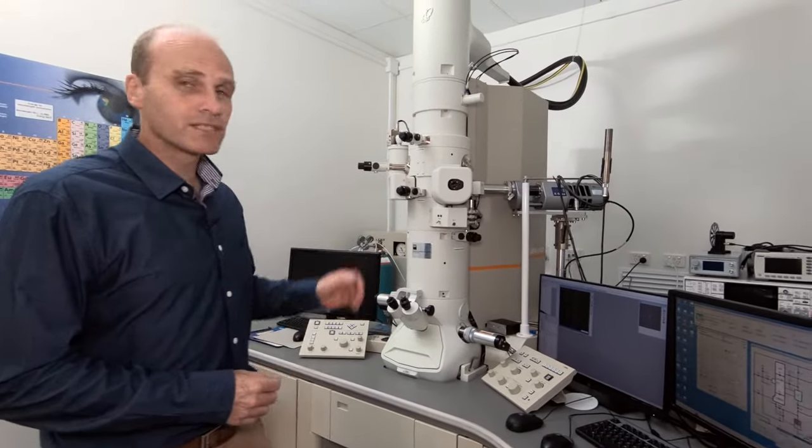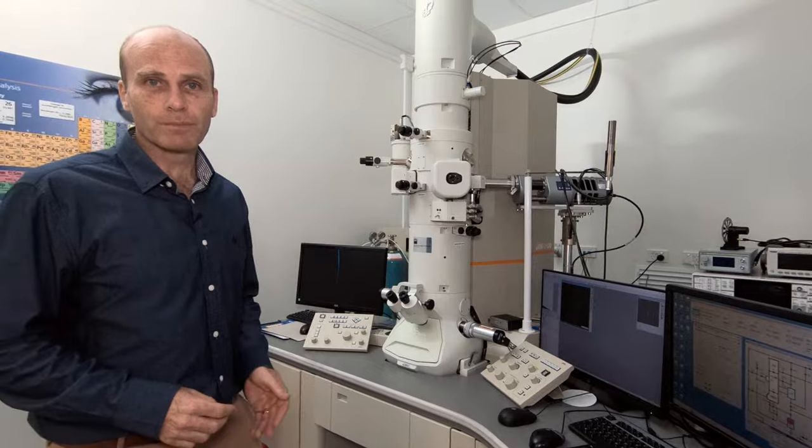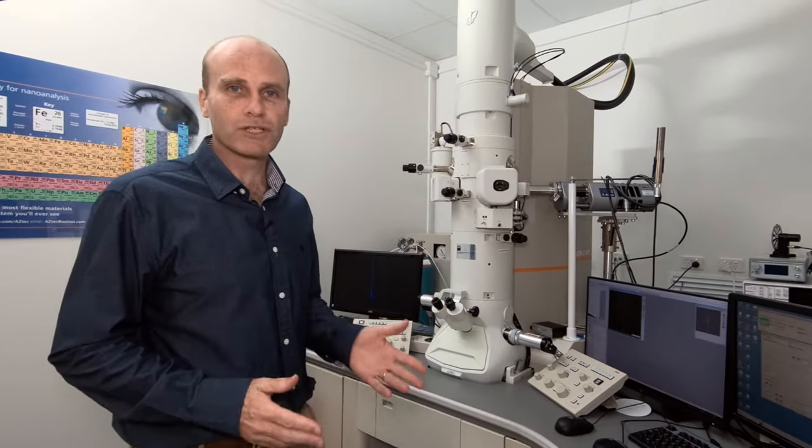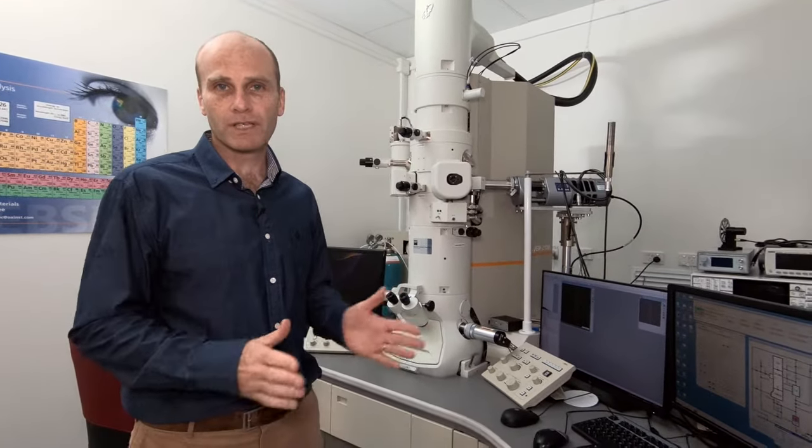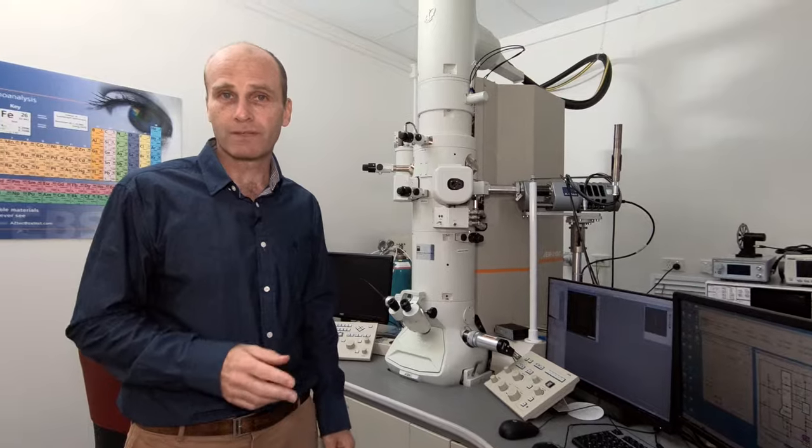This is the TEM that we're going to use in our experiment today. The TEM has the advantage over, say, the light microscope in that it's capable of looking at things at much higher resolution. A light microscope can only go down as far as 200 to 300 nanometers, whereas with the TEM we can see features that are as small as a nanometer or even less.